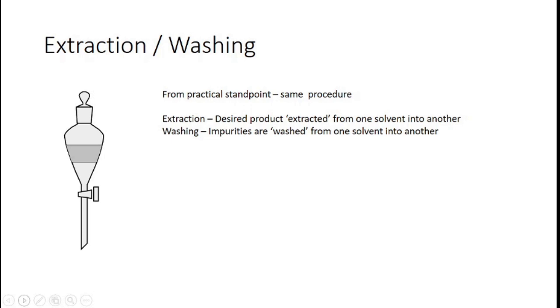They stayed where they were. They were part of, in fact, they made up the organic layer. But instead, when you were doing the wash, you were removing residual acid. Hence the term washing, because we are cleaning the material up. The impurity was washed out of the solution.